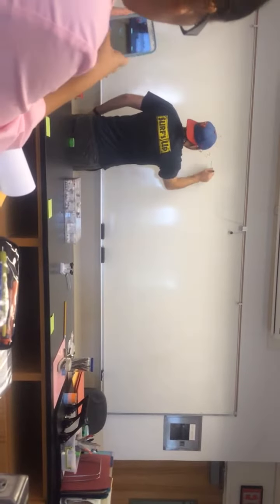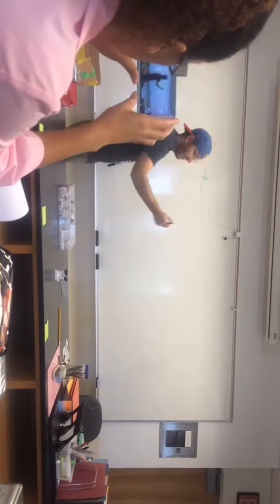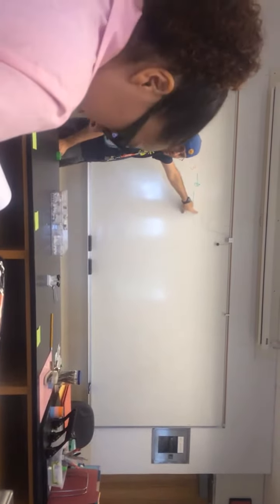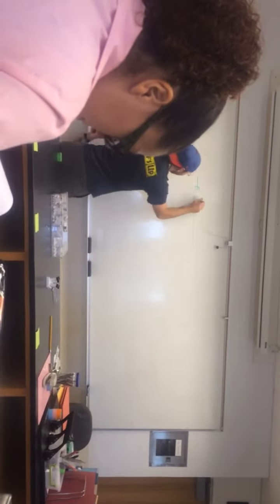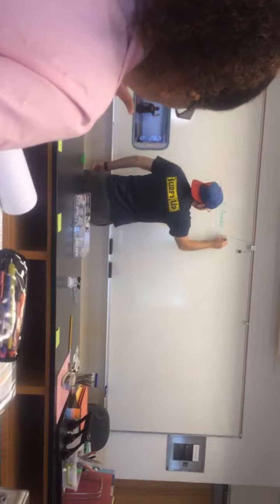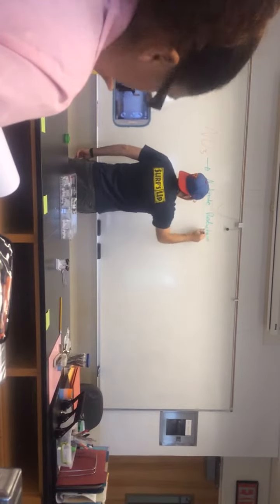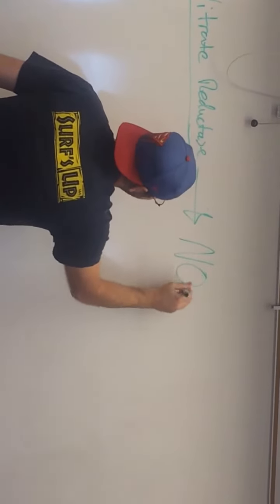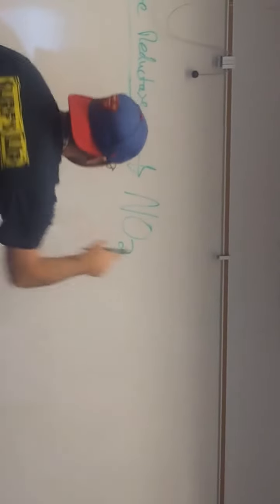Oxidative? Nitrate? Yeah, because we're looking for an enzyme that reduces nitrate. So we need nitrate. Okay, the bacteria produces what? What's the assay called? Nitrate reductase. If it produces this, we get what? Nitrite. Okay. So, how do we test for nitrites?